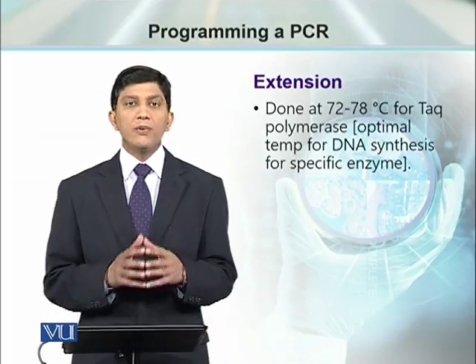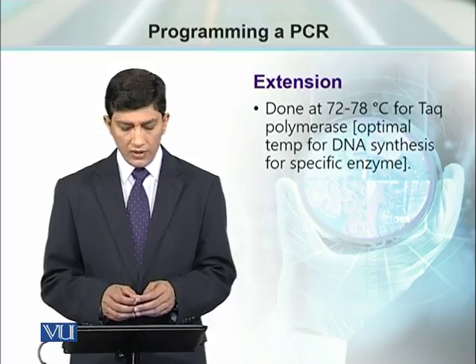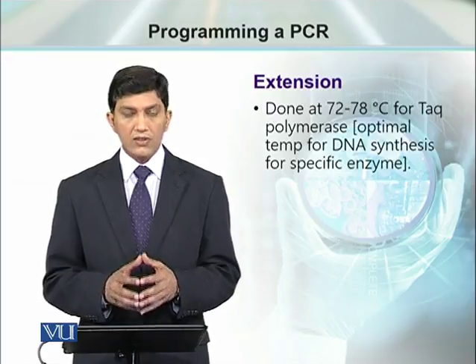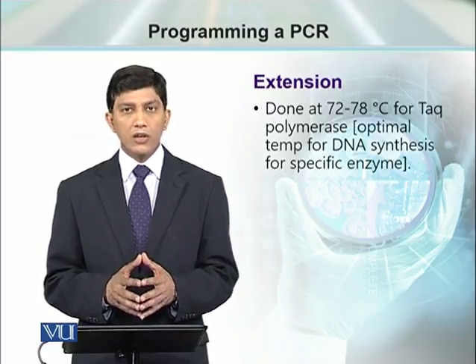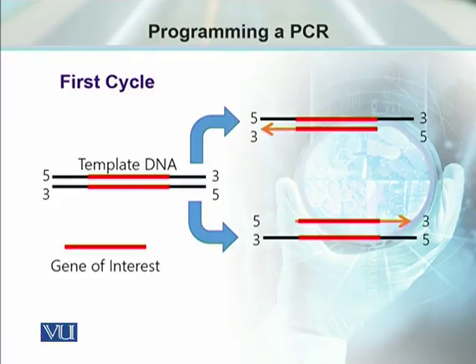Then the third step is extension, which is achieved at 72 to 78 degrees centigrade because this is the best temperature range for working of Taq polymerase. Once we program the PCR and we set it up and start it, then we have to see from which cycle of the PCR we will get our required DNA fragment amplified.